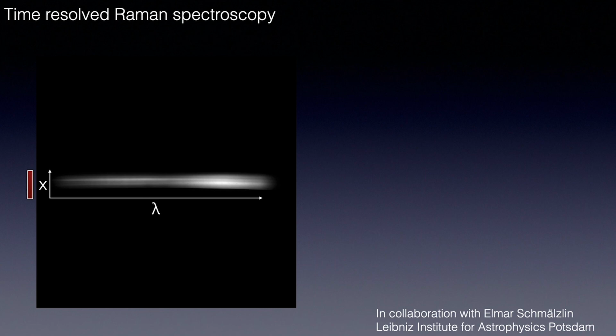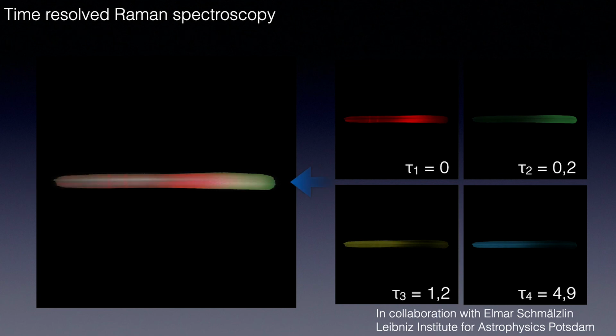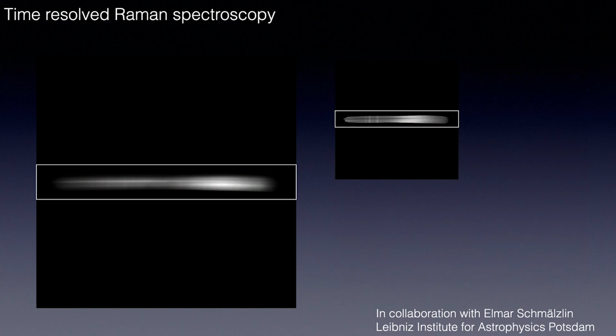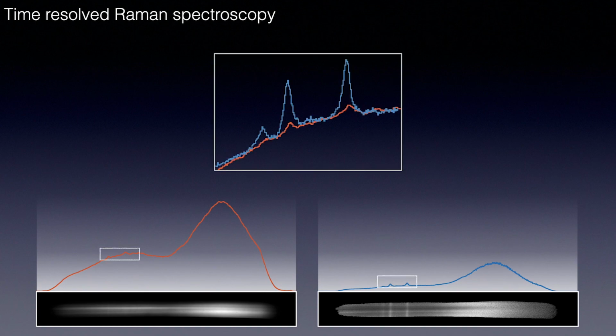Instead of a simple gating of early photons, here we can apply a multi-exponential deconvolution. The fastest component, where tau is 0, corresponds to a sub-picosecond photosynthetic complex's fluorescence and the Raman signal fingerprint area. Now we can see the bands much more clearly. To the left you can see what one gets with a conventional sensor. To the right you can see significant signal-to-noise ratio gain. It is important to mention that this analysis really fits the fluorescence component rather than simply gating the early photons.